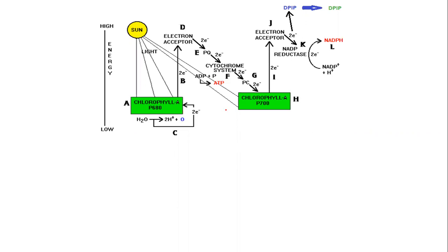This is what you would actually be doing in the lab if we had the ability to go into the school building. Now here we have the light reactions of photosynthesis. You see them on the screen. This is a review from what we had in the lecture. So I hope you looked at the lecture video before we do this. There is one on photosynthesis and respiration, and it describes photosynthesis in detail for you. But this is a review.